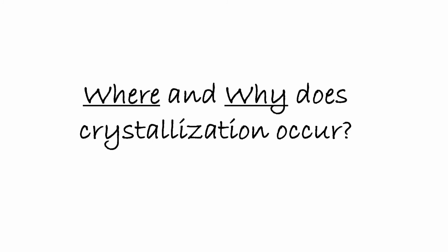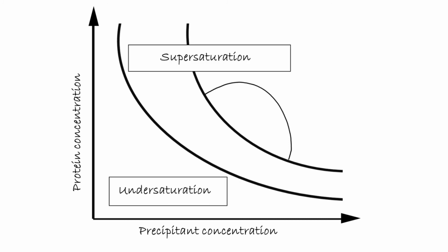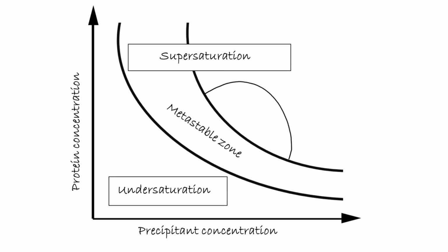What we aim for in part of my project is trying to find an efficient way to analyze those screening results and link them to a crystallization phase diagram. The basics of a protein crystallization phase diagram include the undersaturated and supersaturated zone. It's also known that optimal growth conditions exist in the metastable zone, and that the nucleation zone is where we can observe crystal formation. This diagram would give us a better idea of where to find more crystals and how to optimize membrane protein crystallization.